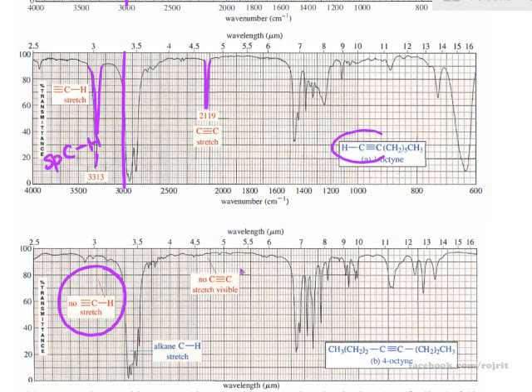So what you can see is nothing here at the triple bond region. This may confuse you with the alkane, right? So we cannot do anything here. You need something else to confirm that you have the alkyne in the structure, and the technique is carbon-13 NMR, which we're going to talk about later.